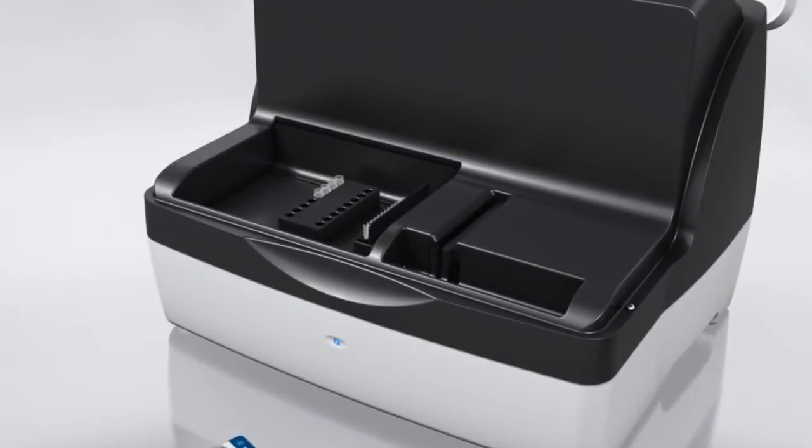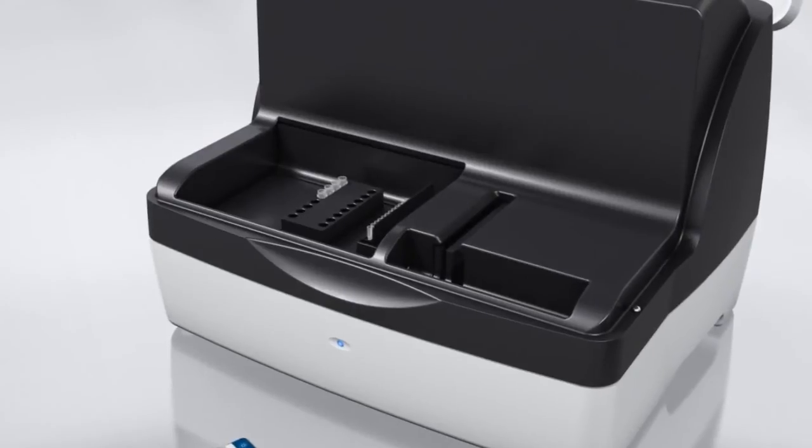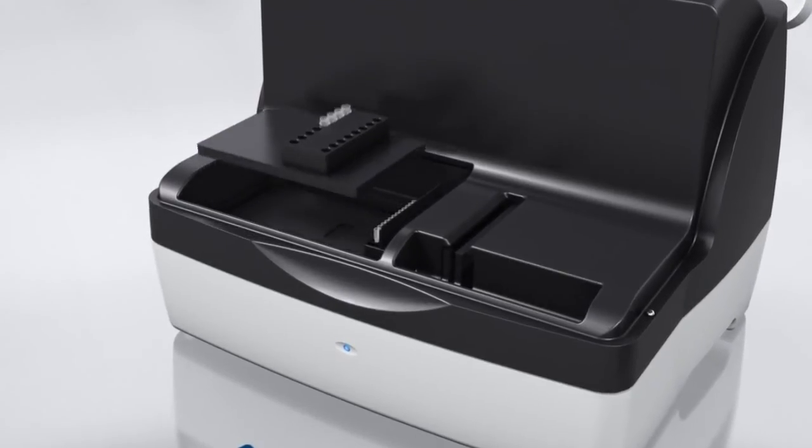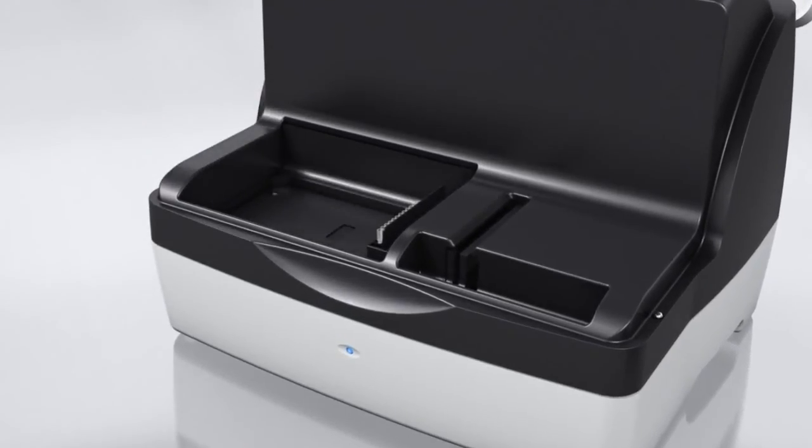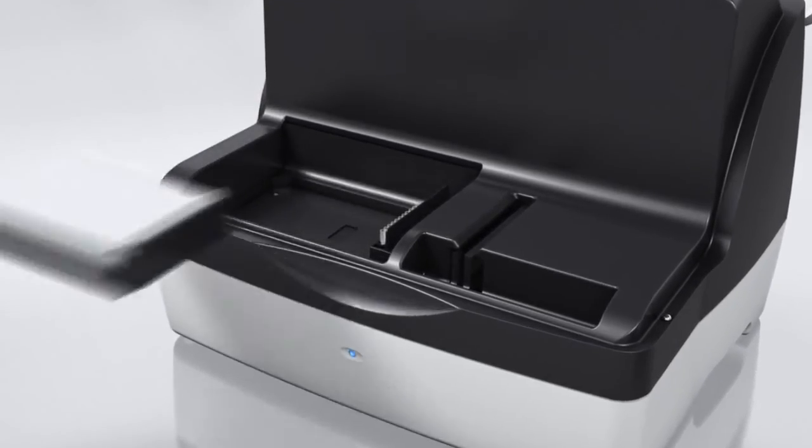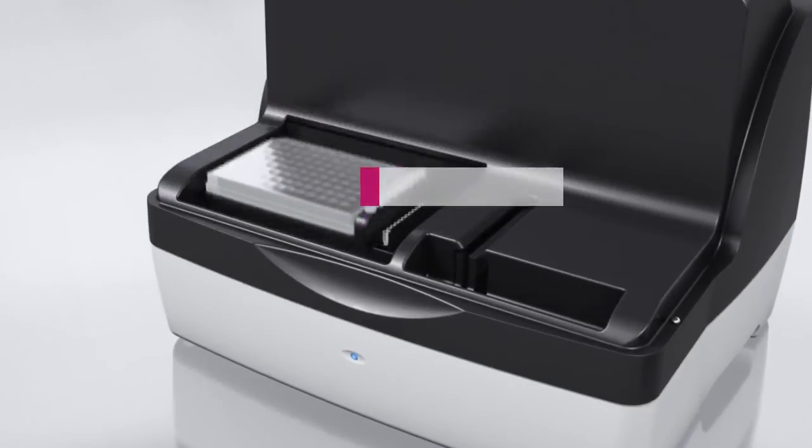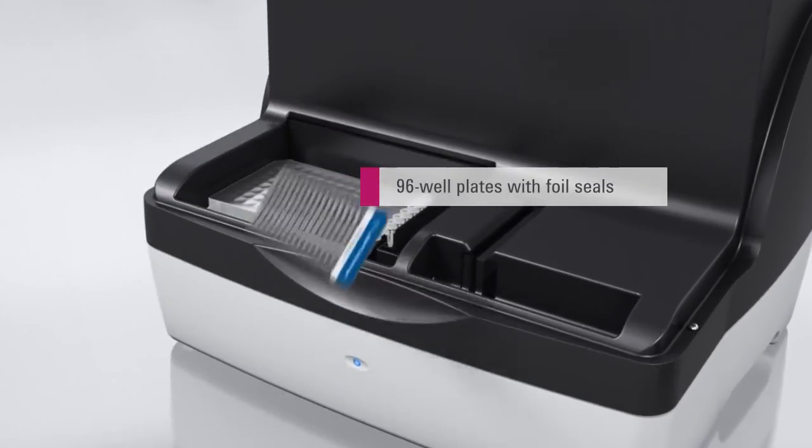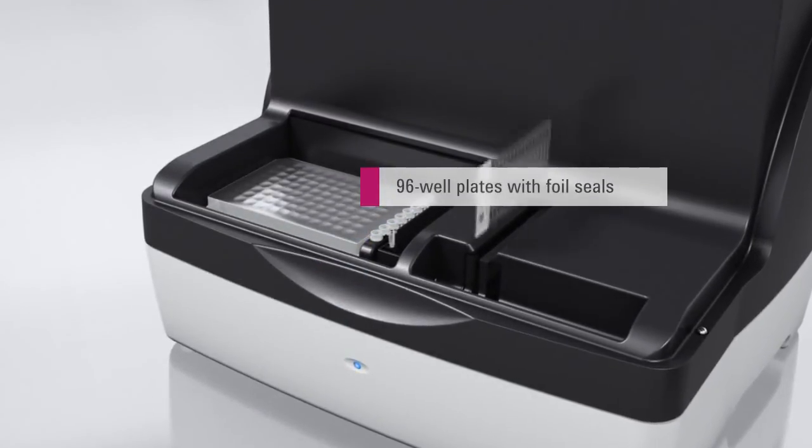For highest scalability, the Agilent 2200 tape station handles 96 well plates. Sealing the plates with foil prevents sample loss through evaporation.